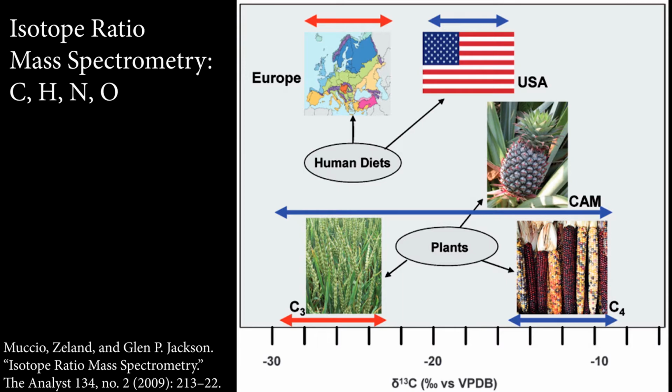Obviously, there's carbon-12, carbon-13, oxygen-16, oxygen-18. Those guys, the relative isotopes for these different elements. Now, there's not as much of the other isotopes, but we can measure these really, really accurately, and we can get good information about them. We have to approach it a little bit differently in terms of ionization, because they're organic compounds. They don't do well in ICP. They don't do great necessarily with the same kind of thermal ionization we just talked about.